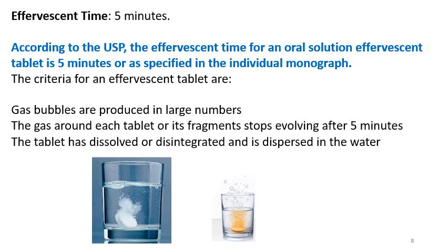Effervescent time also depends on the formulation and the tablet weight. According to the pharmacopoeia, the effervescent time of an oral solution effervescent tablet is 5 minutes or as specified in the individual monograph. The criteria for effervescent tablets are gas bubbles are produced in large numbers.